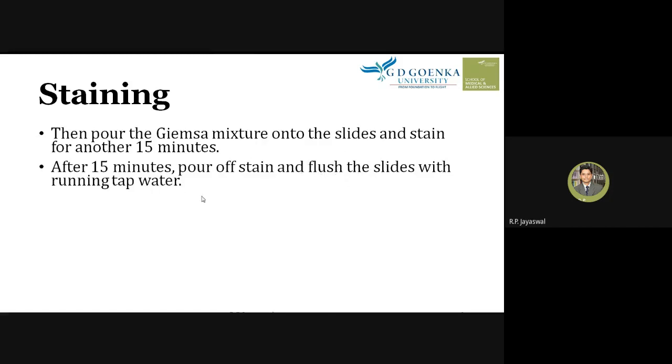That should be done gently to avoid destruction of the smear. So do not harm the smear. When we put the smear under the running tap water, just ensure that the tap water does not wash away the smear.